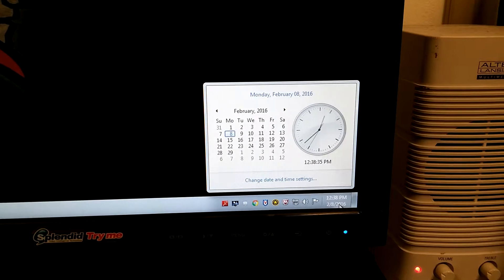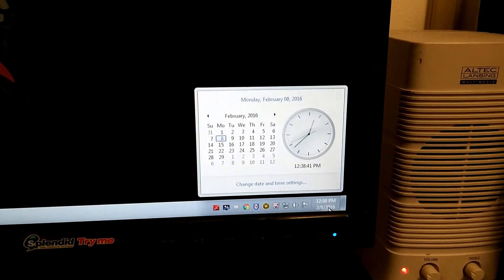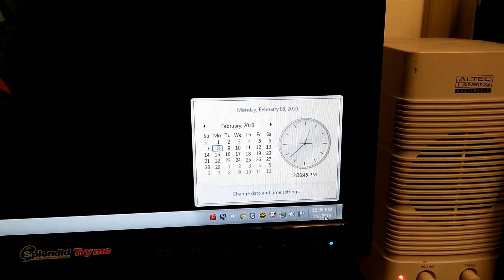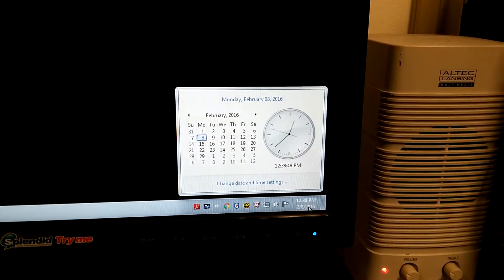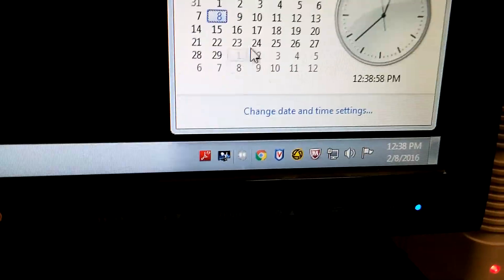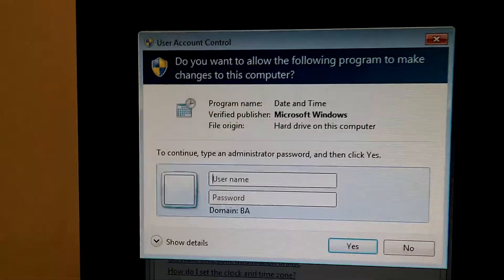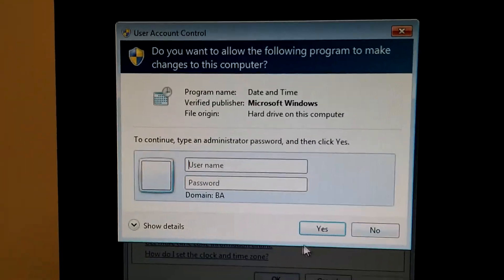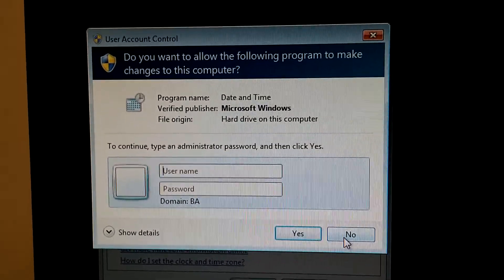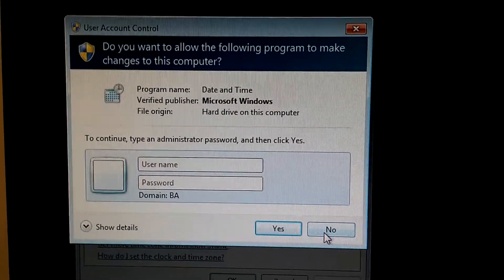When syncing your computer with your phone, I would recommend that you have an app on your phone that allows you to see the full time, including the seconds, so that you'll be as precise as possible when syncing your computer's time to your phone. At least on Windows, you can do that by clicking 'Change date and time settings,' then clicking 'Change date and time.' When a new minute ticks over on your phone, have that same minute ready to save and submit.